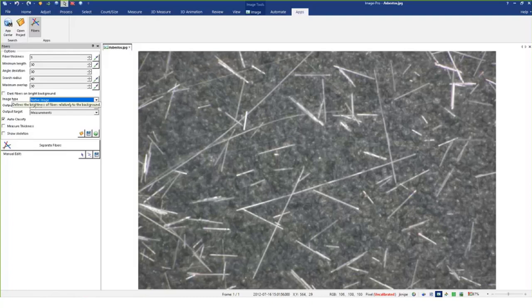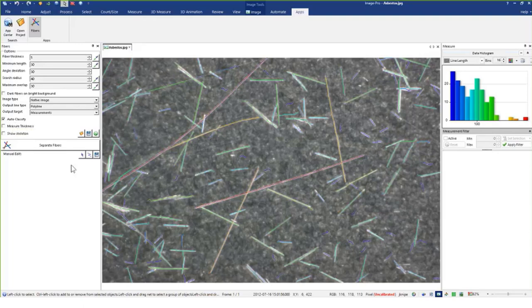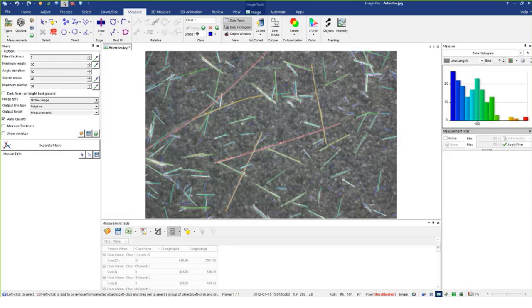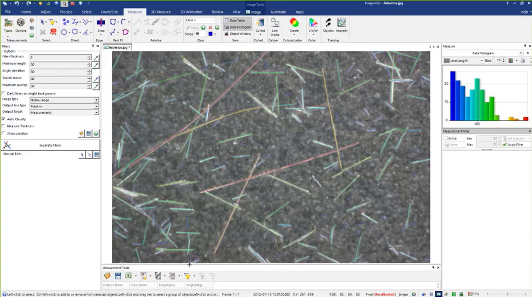Let's try the default settings. Here I have bright fibers, so I'll press Separate Fibers and see how well it does. You can see it's color-coded because auto classify is set — if I did not have auto classify set, they would all be the same color. Let me show the data — it's under the Measure tab. Here are all the fibers with length in pixels; if the image is calibrated it would be in calibrated units. You're also given the angle versus the horizon.